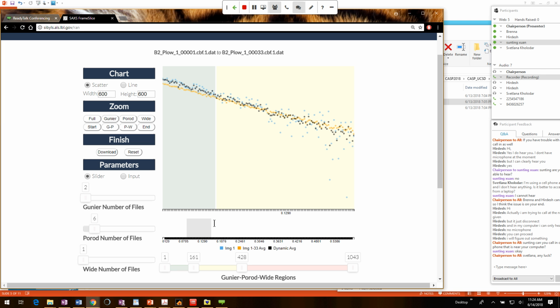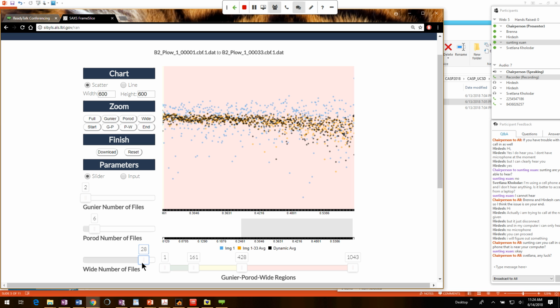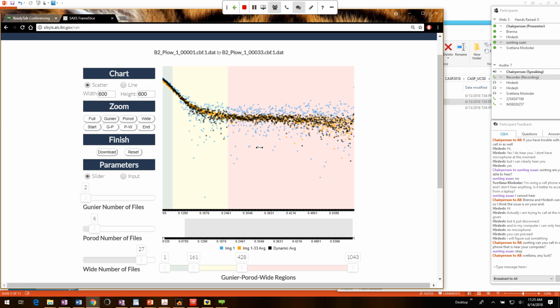I'm now going to look at the wide Q region, so I can actually just click wide and crank that out. And it looks like I can use quite a bit of the data in the wide Q region. I can use like 27 frames in the wide Q region here. That's good. Let's extend this a little bit here. And then you can see as the Porod region, maybe I'm able to use more data in parts of this yellow.